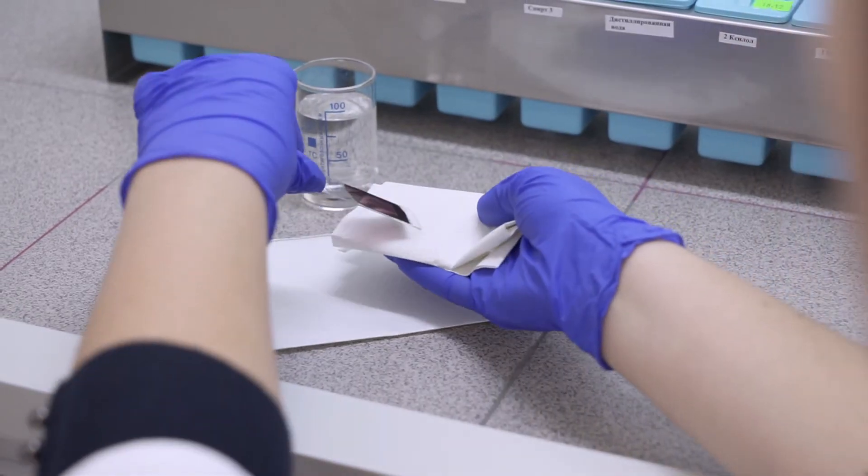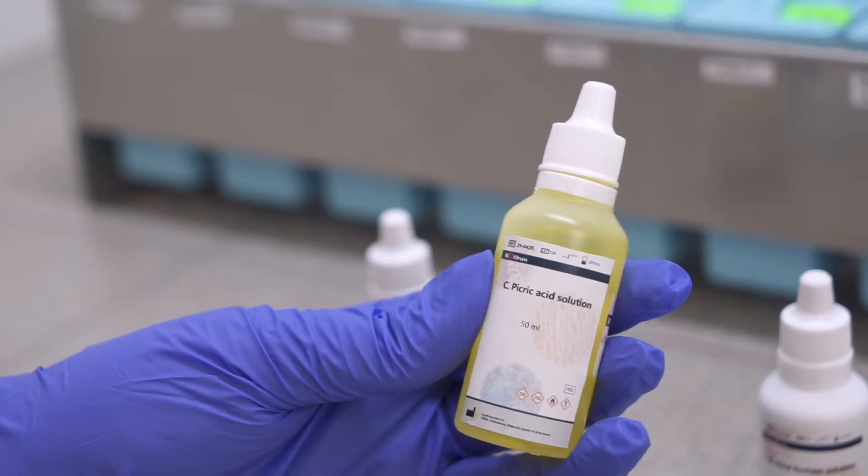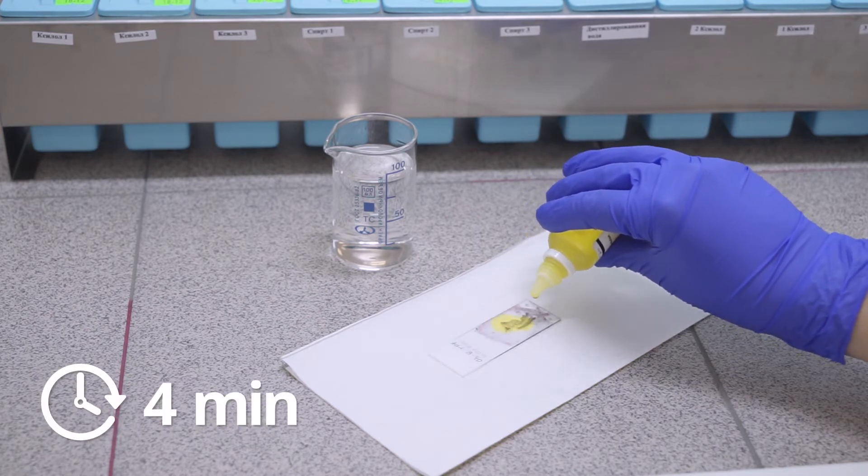Then we dry slides without washing them and put on them solution C. It is an alcoholic solution of picric acid. We put it on the slide for 4 minutes.